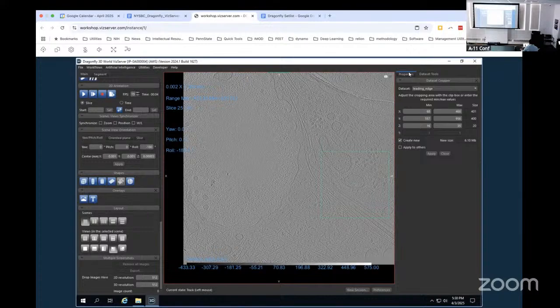We're going to go to plan B and just pull up already cropped data, but I want you to know how to crop. Oh, I see. People's are flipped in different orientations, so that's not too helpful.